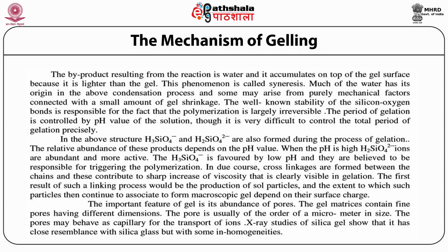The byproduct resulting from the reaction is water, and it accumulates on top of the gel surface because it is lighter than the gel. This phenomenon is called syneresis. Much of the water has its origin in the above condensation process, and some may arise from purely mechanical factors connected with a small amount of gel shrinkage.